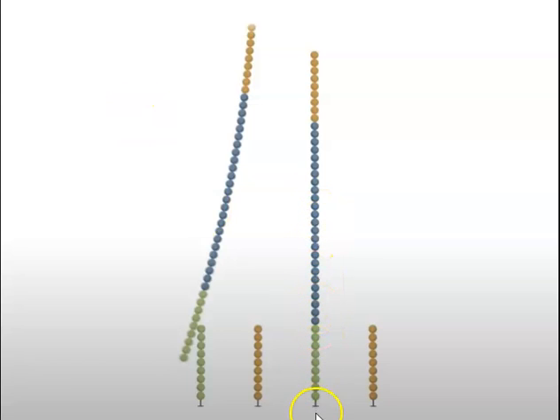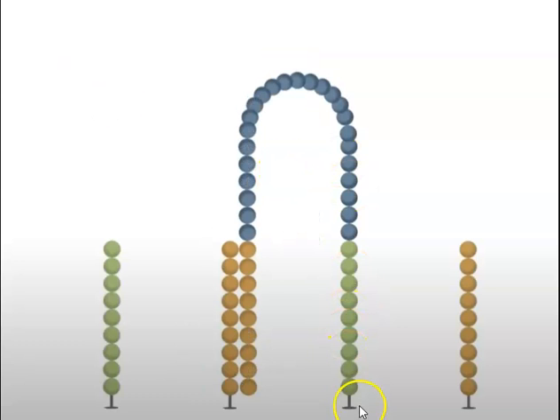Now this means that this is now directly chemically attached to the flow cell rather than just being attached via interactions between nucleotides. Okay, so this piece of DNA is chemically attached to the flow cell as we've just seen. What that can do is fold over and come into contact with the other type of oligo, allowing now DNA polymerase to be added. This will bind to a free 3' OH here and copy this piece of DNA, so we now have two pieces of DNA, sense and antisense, both chemically bound to the flow cell.